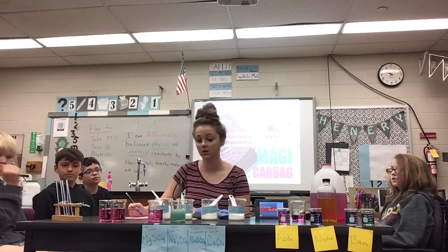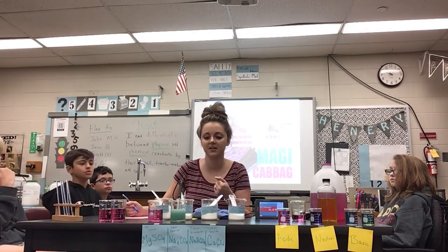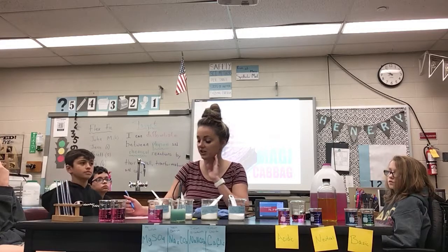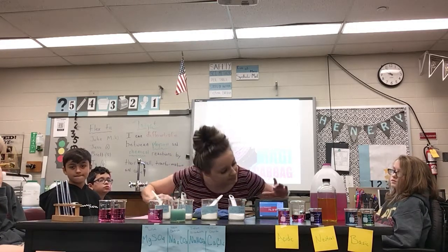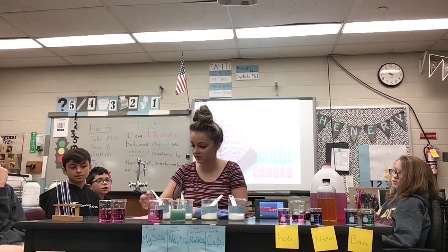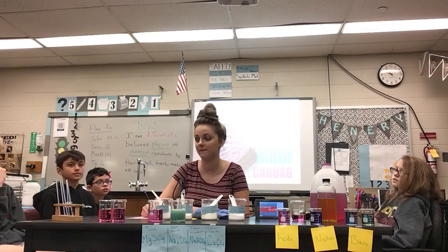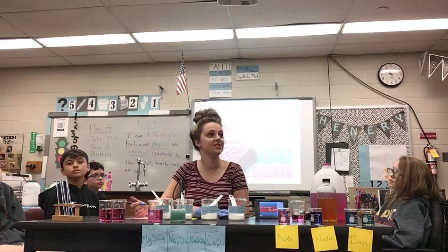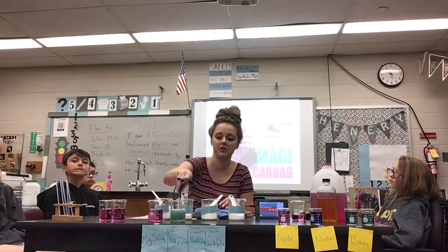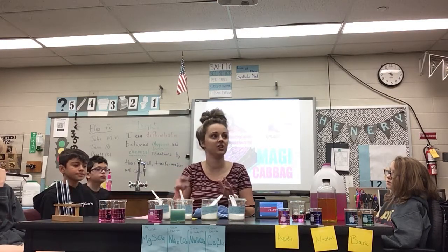Basic. Did we have a smell? No. Was there a precipitate? No. Was there a physical or chemical change? Yes. Chemical change. What are we hitting for temperature? 70.9. 72. So about 72. Is it stuck at about 72? Yeah. Okay, we'll hit 72. Our original was about 70, so 2 degrees. It's all right. Typically, we look for like a 5 to 7 degree swing.